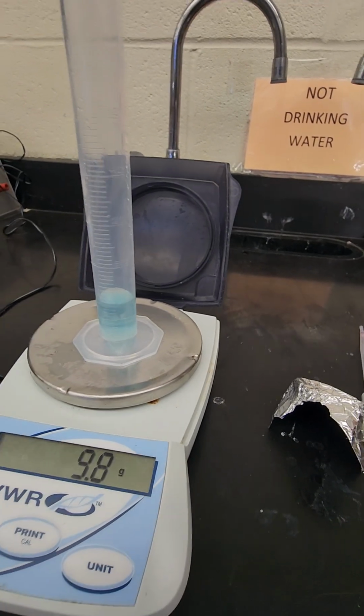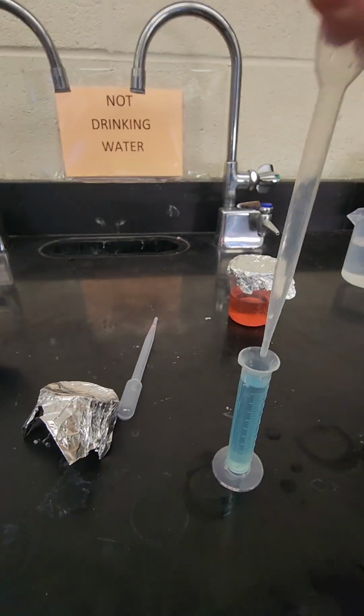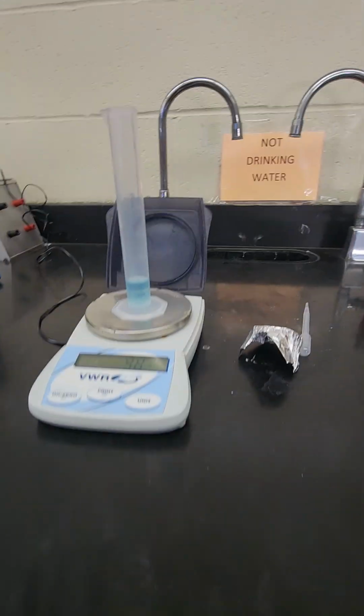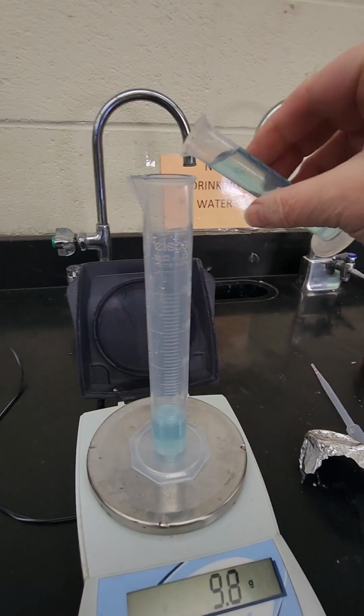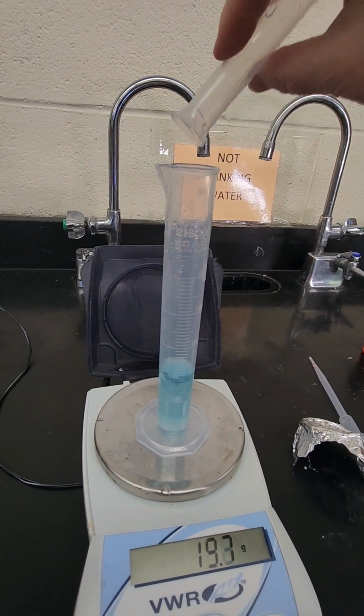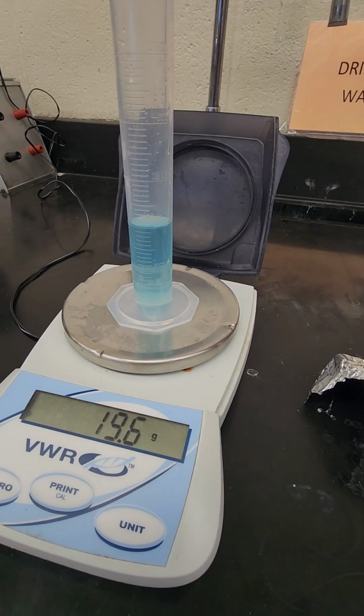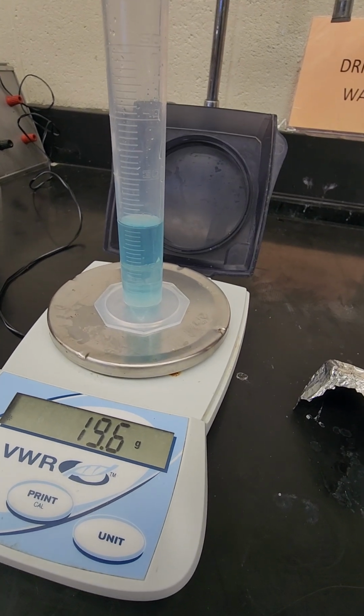I'm going to repeat the process. I have a little bit too much, so I make sure I have it completely on the meniscus. Then I'm going to pour 10 milliliters for a total of 20 milliliters in, and now my mass is 19.6. I'm going to write that down into the data table.